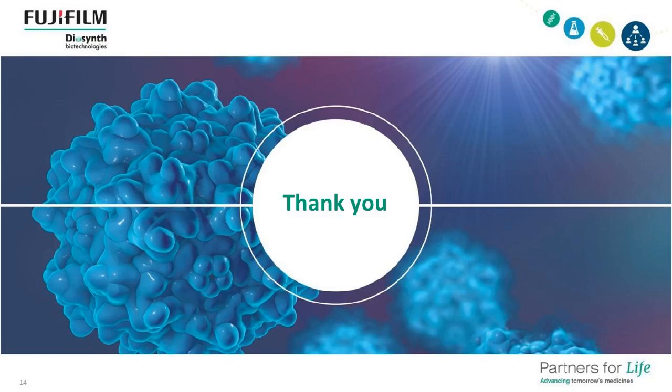And so yeah, inherent to the operation of the system, you're performing numerous VHP cycles to decontaminate. And then we have developed a cleaning approach to remove particulate, and we actually use these crime scene rollers that the FBI uses to recover fibers. So that helps us remove any particulate from the environment, and it acts as a cleaning approach as well as a detection method. So it does double duty.